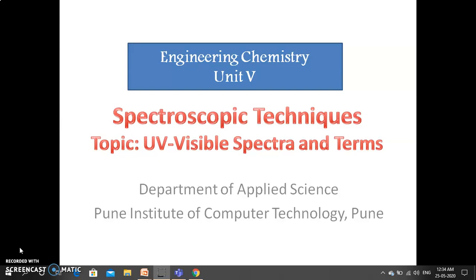The analytical technique which is used to analyze the sample based on its interaction with the UV visible radiation is called UV visible spectroscopy or UV visible spectrophotometry.